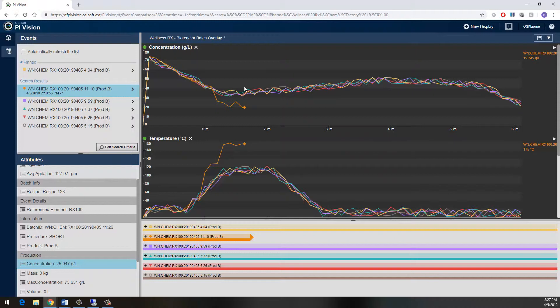I need to run and talk to my other engineers and operators about what's going on, but hopefully this gave you an idea of how the PI system can be used to monitor critical systems in real time so you can identify, investigate, and mitigate issues as they arise.